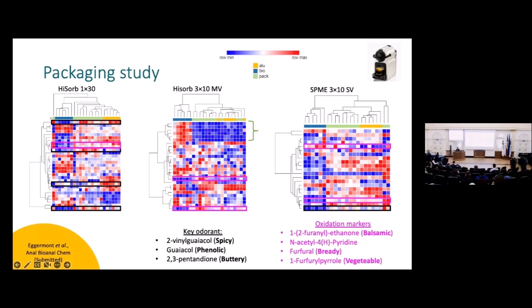Another thing that we have observed is that we have a group of features that we were not able to identify, that are coding for early eluting compounds. It's on this part of the chromatogram on which we can find some acetic acid, for instance, and some sulfurous compounds.